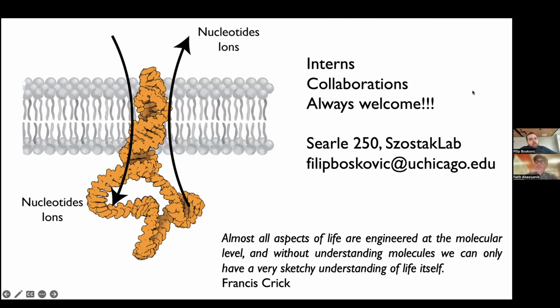So keep in mind that for nanopore, you don't need to do that stuff. So let's say you don't need to have GC rich sequence. You don't need to have balanced ATCGs. Even the latest nanopore that the company made actually sequences your molecule within the pore 2 times. So there are 2 constrictions like this. So the molecule goes through and it sequences here and then it sequences here. So they actually show that they can do also homopolymer sequencing. That's one of the problems with Illumina as well, where you have AAA, CCC, GGG, TTT. So in that sense, you don't need that.